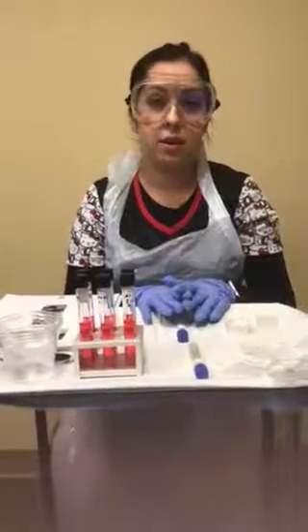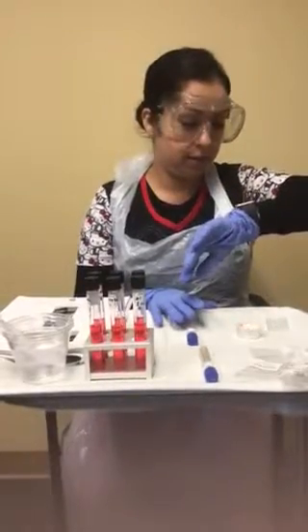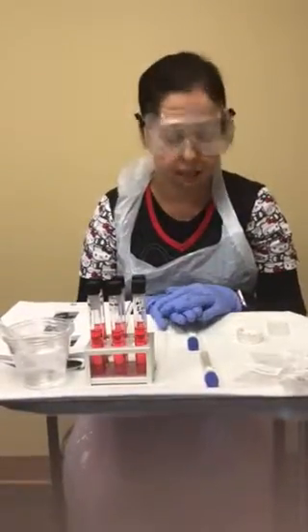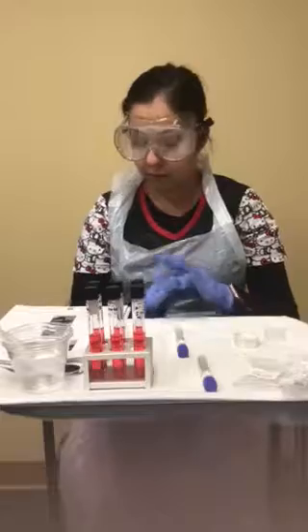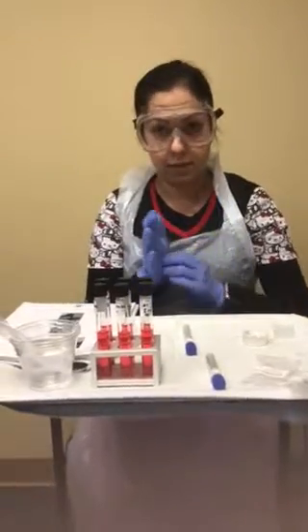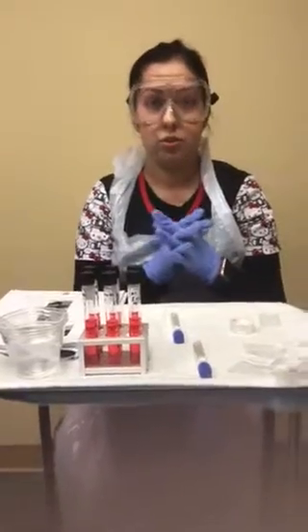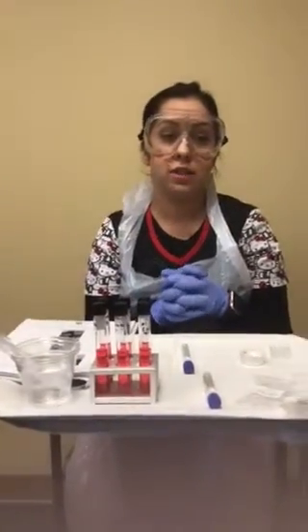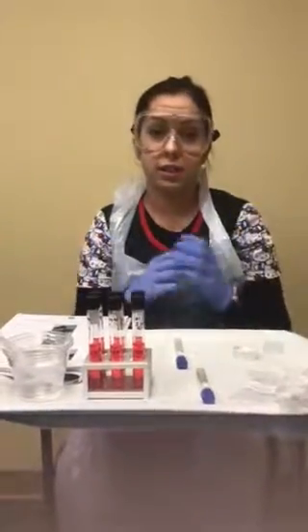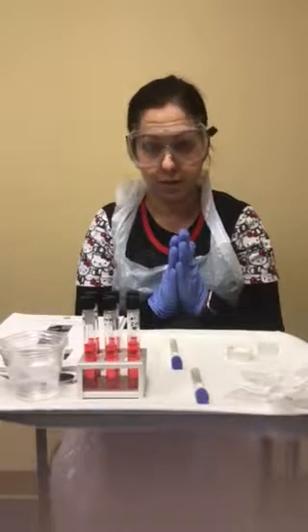Today is March 29th, 2018, and while I'm waiting for my previous experiment, the multi-lady test, to incubate, and being that this weekend is Easter Sunday, instead of worrying about all these different assignments to do, I'm going to go ahead and get started with week five.